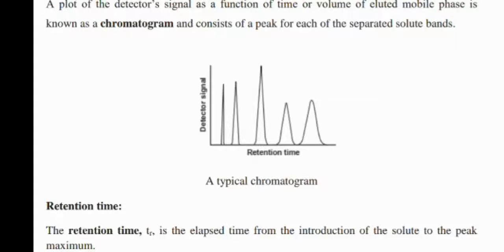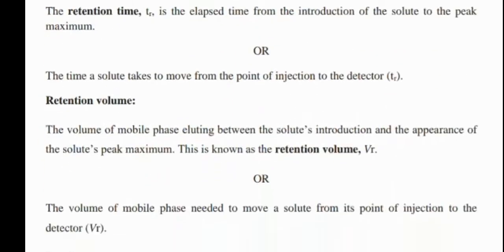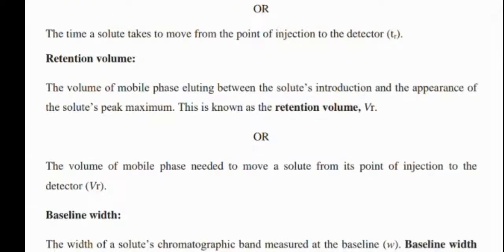Another one is the retention time. The retention time TR is the elapsed time from the introduction of the solute to the peak maximum. And the retention volume is the volume of the mobile phase eluting between the solute's introduction and the appearance of the solute's peak maximum. This is known as the retention volume, VR.